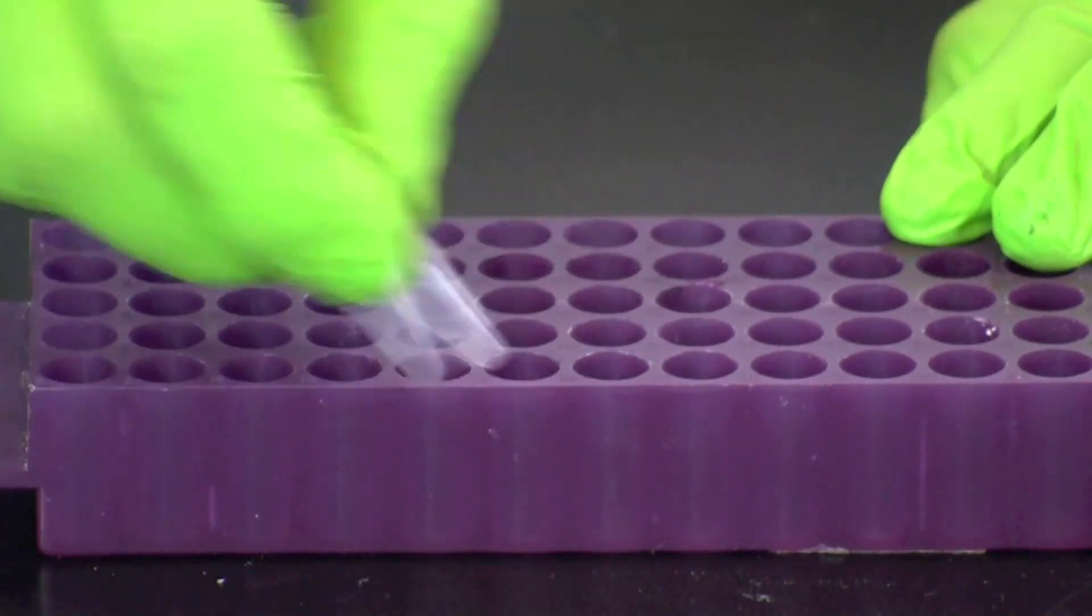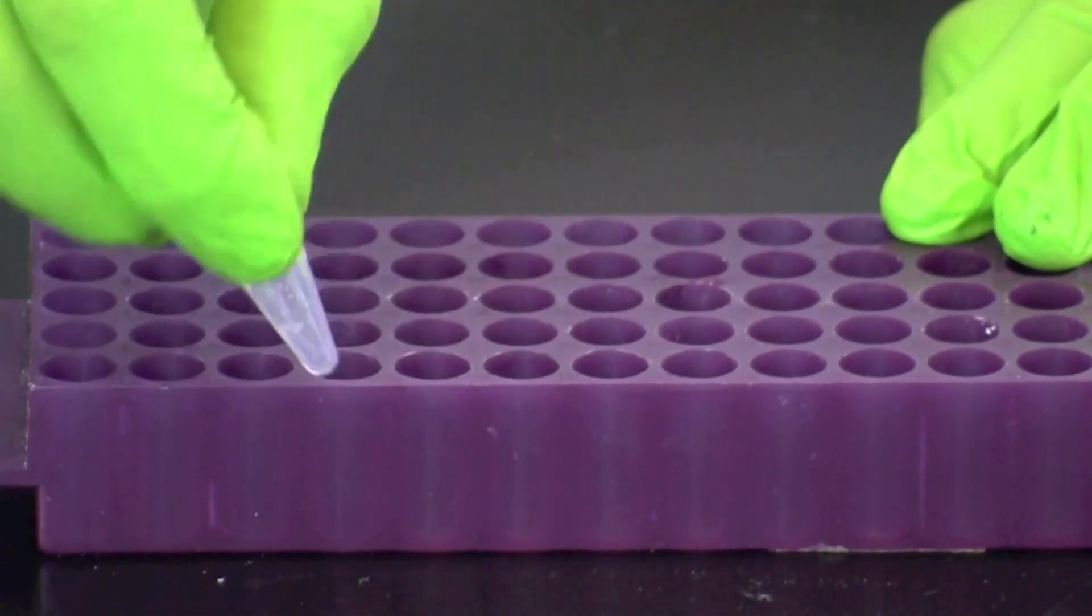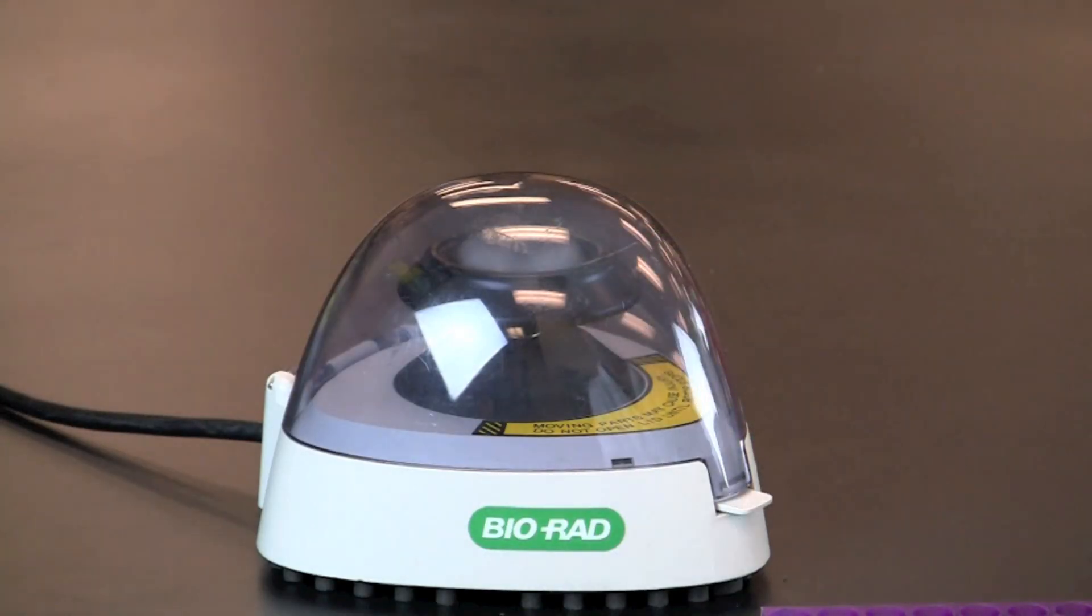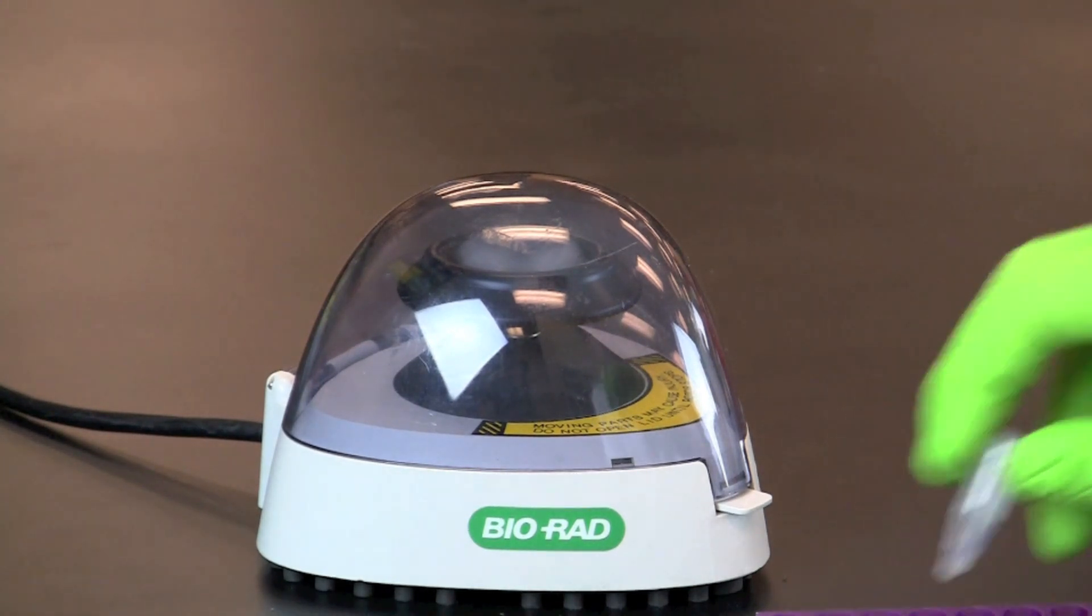After the incubation, vortex or shake the tubes. Place the tubes into the microcentrifuge in a balanced configuration. Centrifuge at top speed for 5 minutes. If using a mini centrifuge that can only reach 2000 G's, centrifuge for 10 minutes.